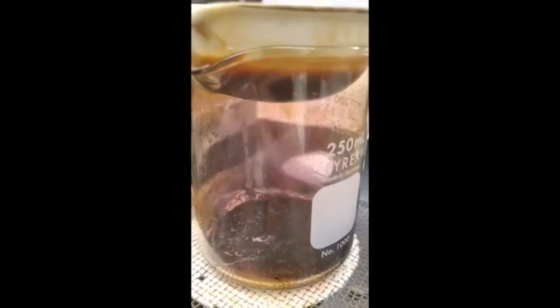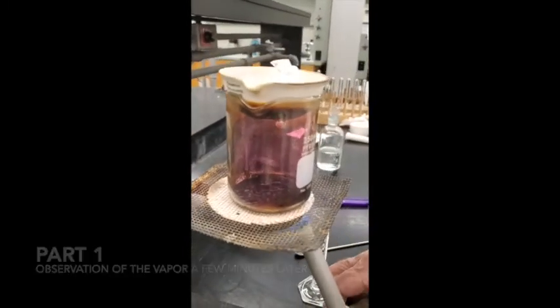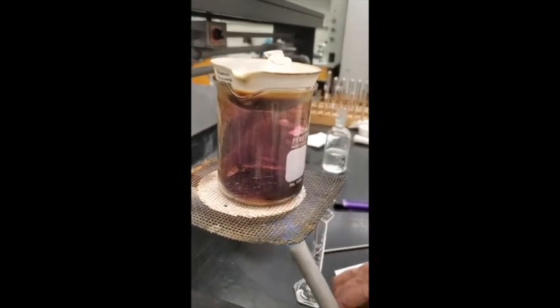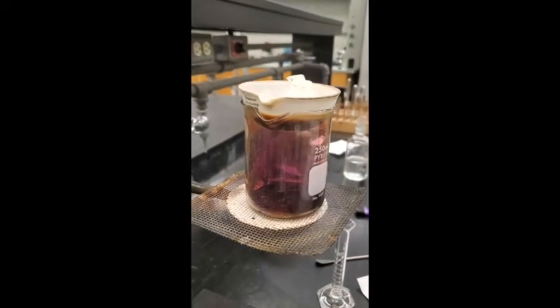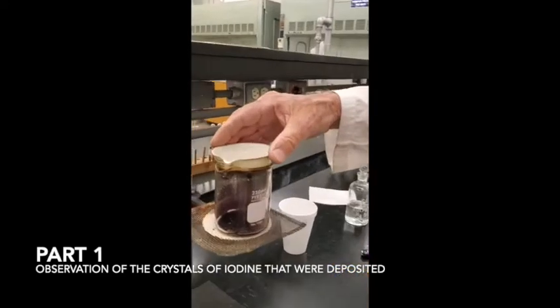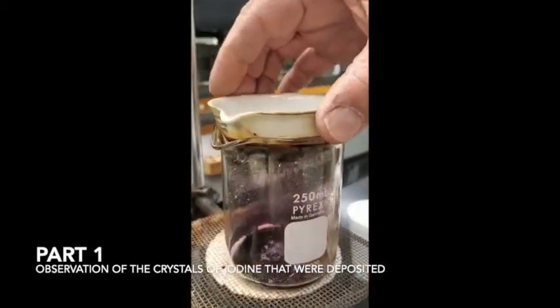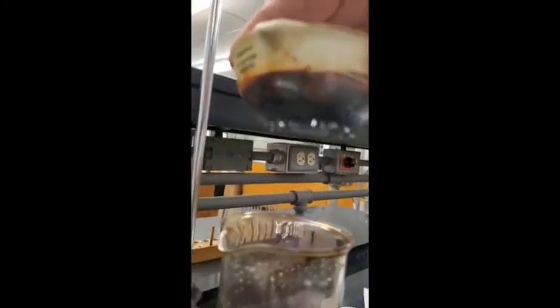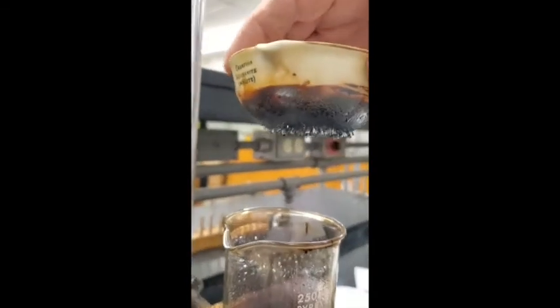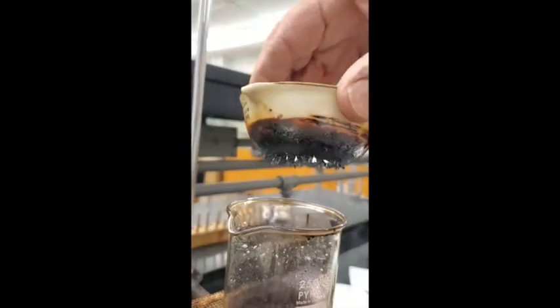Good. I'm heating it up. You're getting more vapor in there now. That's good. Okay, now this is the one where you're subliming the iodine. We have nice pretty crystals in the bottom of the evaporating dish. Can you see those crystals? Oh yeah, they're pretty. It's nice and shiny.